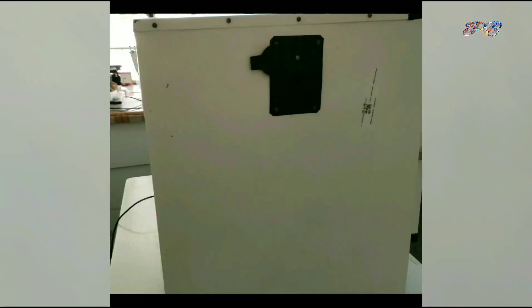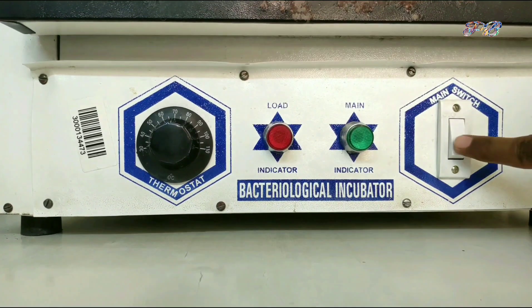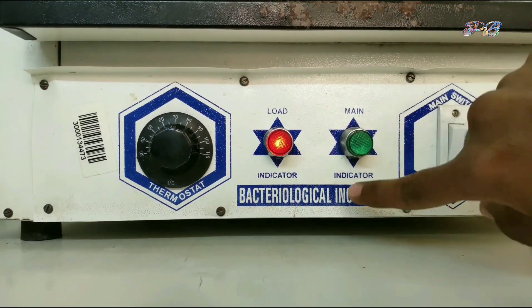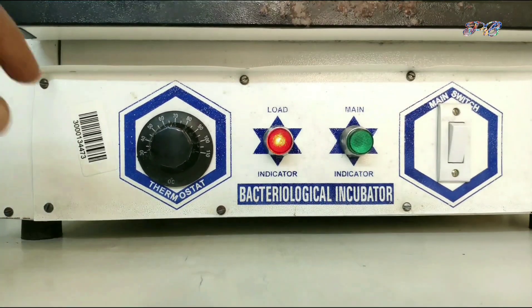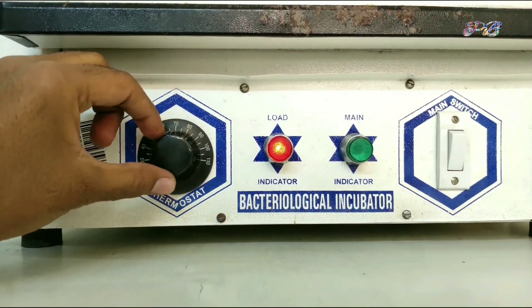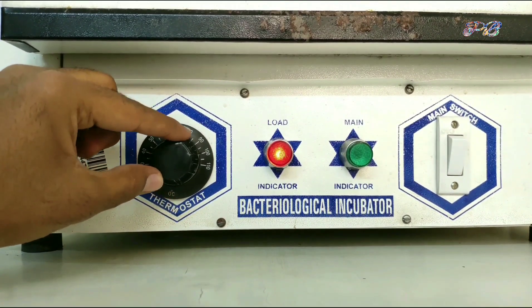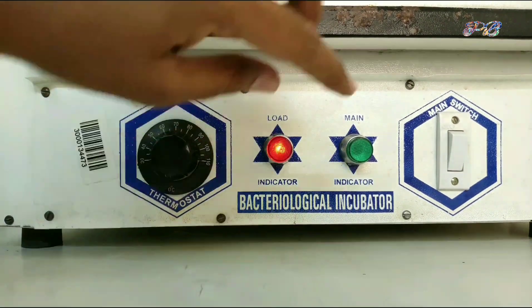It is mainly used in biochemistry for the determination of enzymes in the specimen by the end point reaction method, and determination of glucose, urea, uric acid, cholesterol, triglyceride, etc. by the enzymatic method. In microbiology, it is used to grow microorganisms on various culture media.